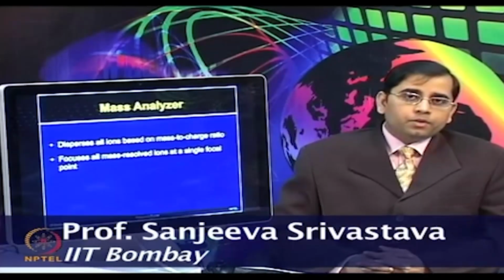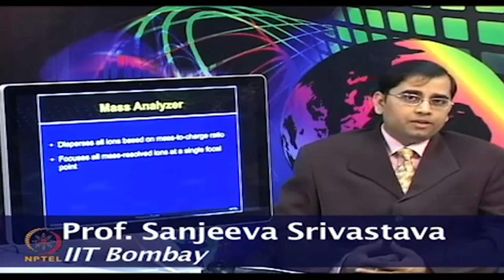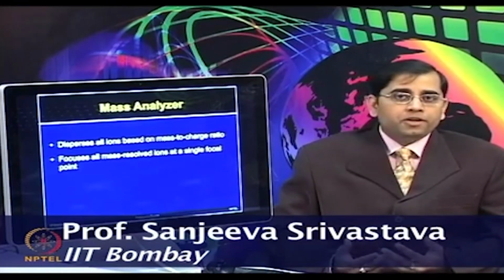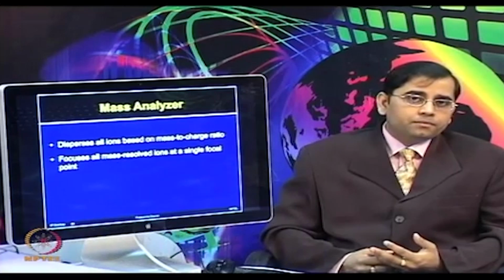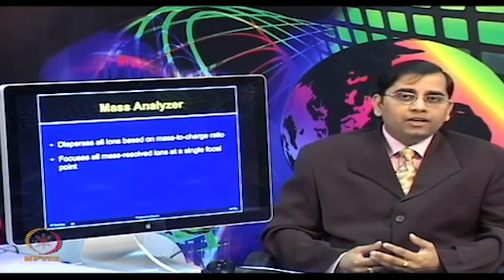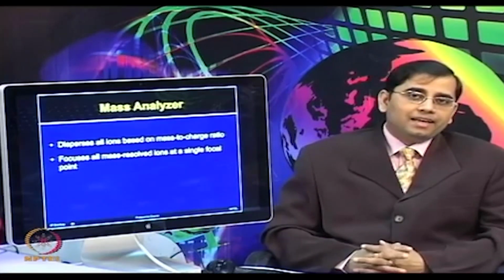So, we are talking about an MS experiment and I am trying to give you an overview of the various steps involved. First of all, we looked at liquid chromatography based pre-fractionation, in-gel digestion, different types of ionization sources, and now let us move on to the mass analyzers.